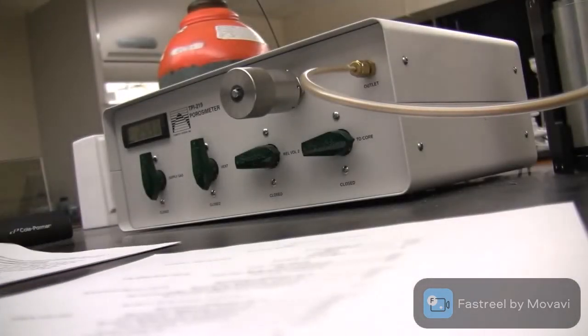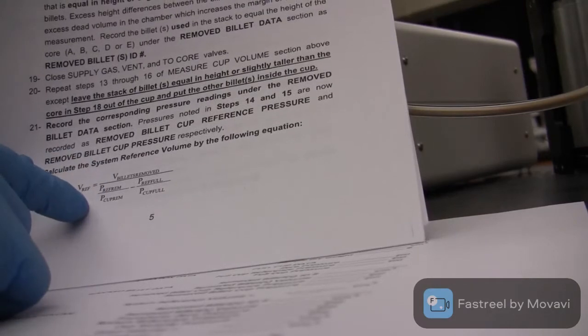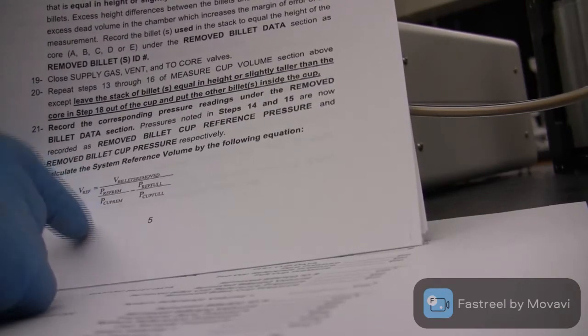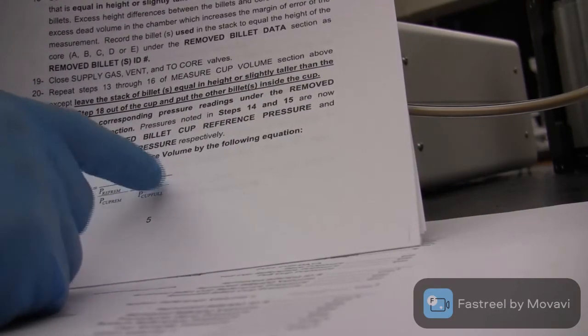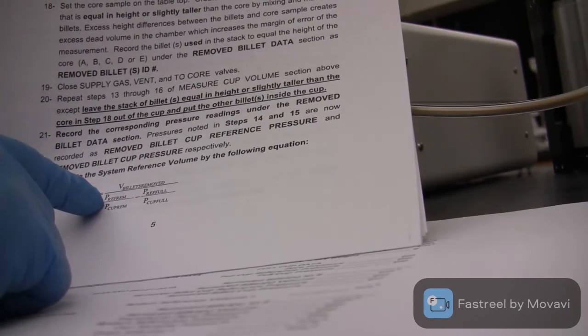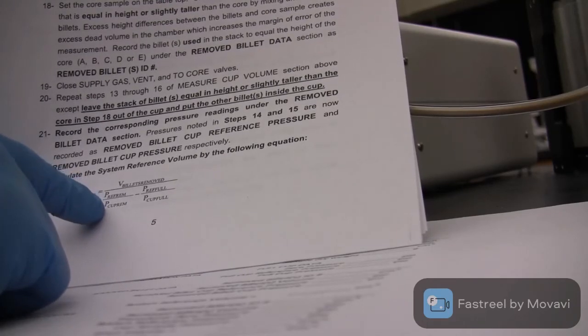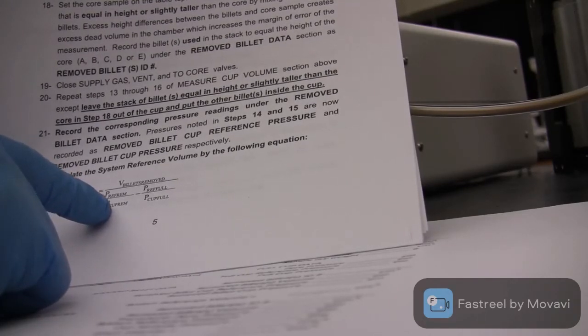After that, you go to your handouts, you will be able to get the volume of our reference volume from this equation. You have the volume of removed billets, you have the reference pressure of the removed billet section, and you have the cup pressure from the removed billet section.